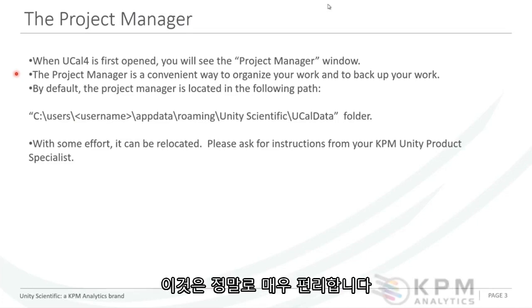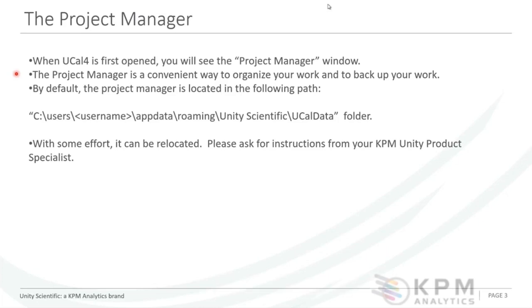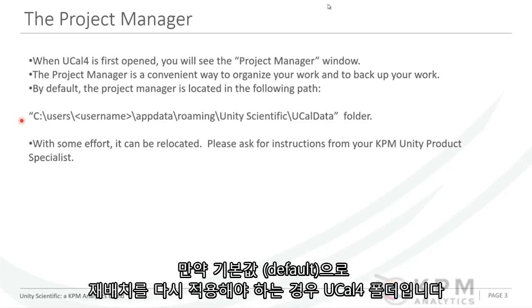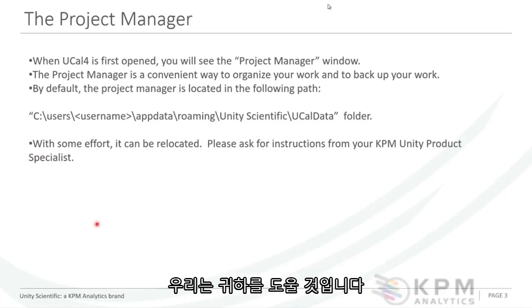And it really is very convenient, and it's a nice way to isolate out your files, okay? If you do need to relocate that, for example, one of my computers, I've got a separate drive for data. If you do need to relocate the default directory for UCal 4, let us know, we will help you with that.